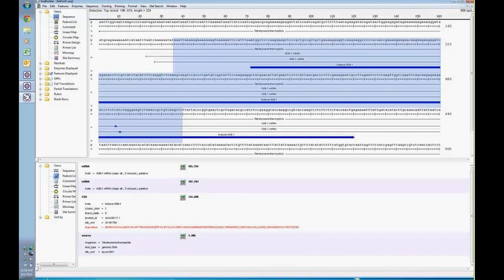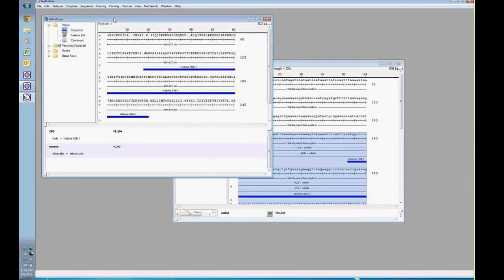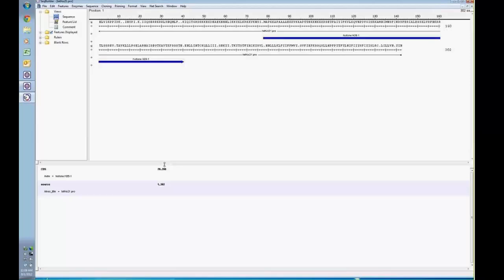We're actually going to minimize this nucleotide here right now. I just wanted to talk about this target, this histone that I'm working with here, this protein. When you're setting up your expression reactions, your projects, everything obviously starts with your targets. In this specific case, I've downloaded this histone from NCBI. I know this is my coding region. This is the translated product of that nucleotide.